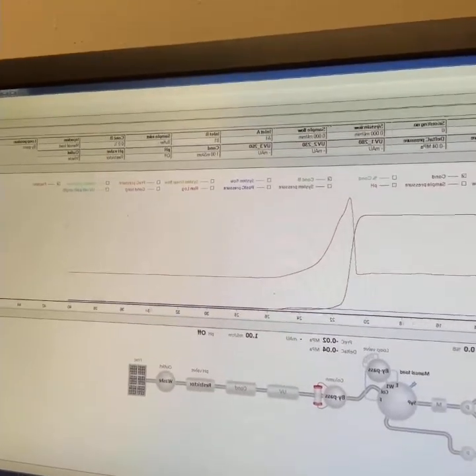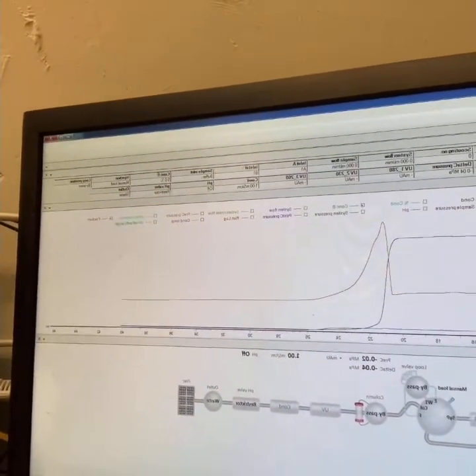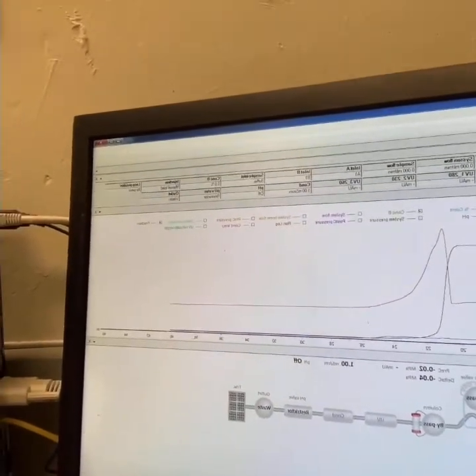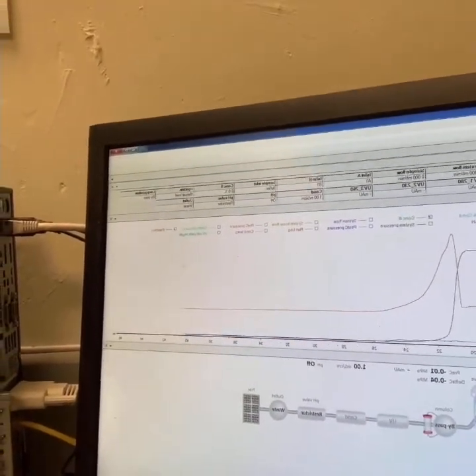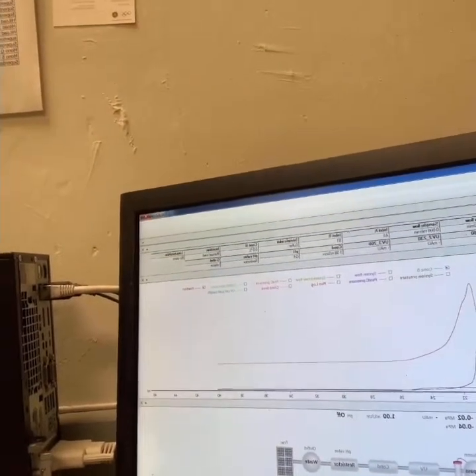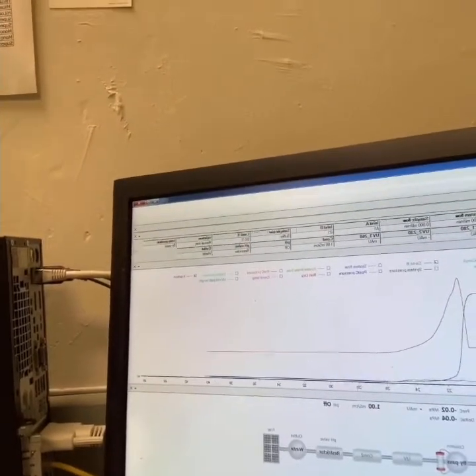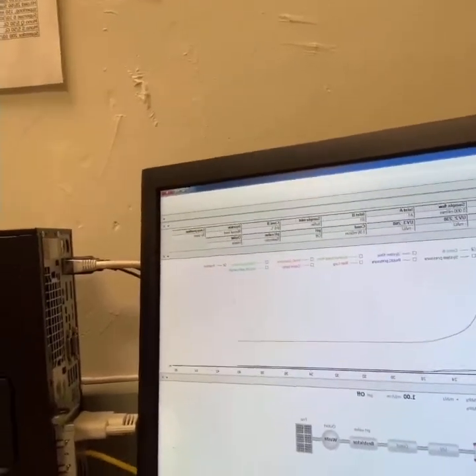So you can see that you have these inlets. So that's where your buffers are going to go. They go through these pumps. The pumps can mix them. So you can mix a high salt and a no salt and then get different concentrations of salt, or competitor or no competitor, that sort of thing.